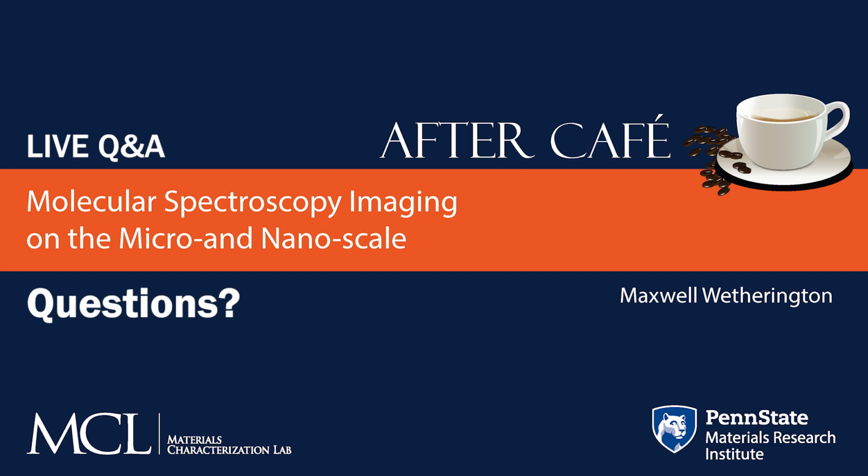These measurements will take one day, whereas if you have a bulk sample, we could do those measurements on Raman in 10 minutes. So it's always good to start even with just optical microscopy, and work your way through to help us identify what question we're trying to answer at this length scale, because we can't look over a large area with this particular technique.